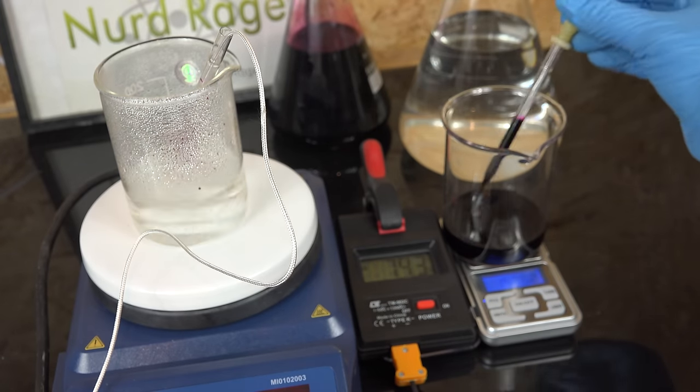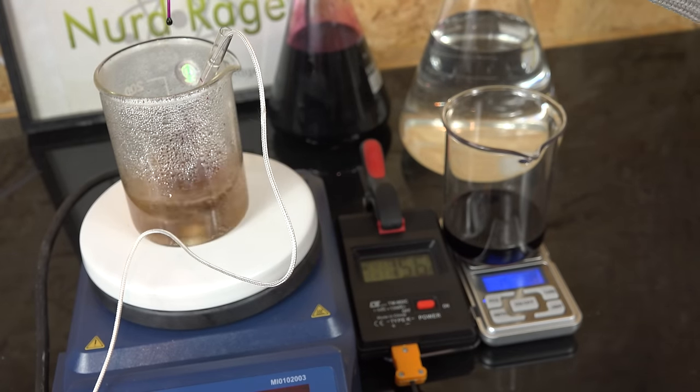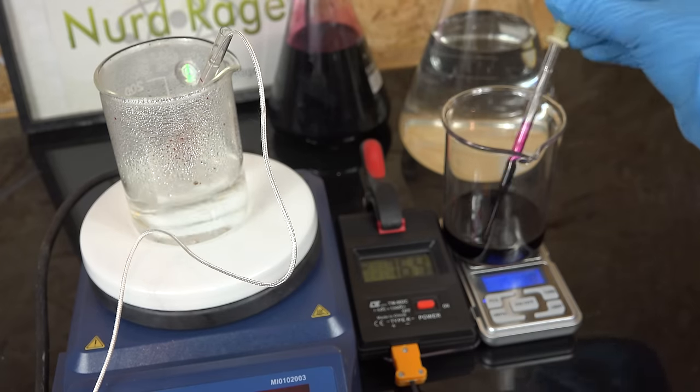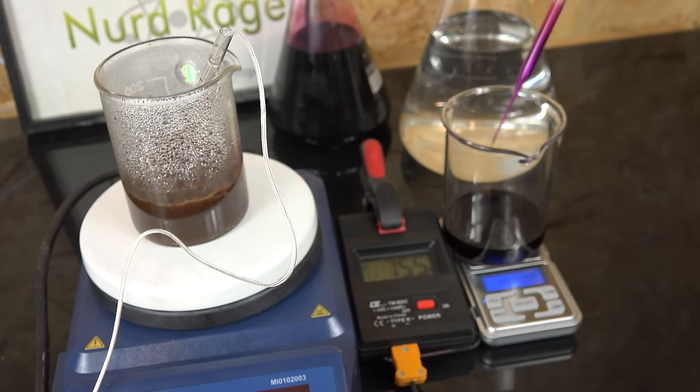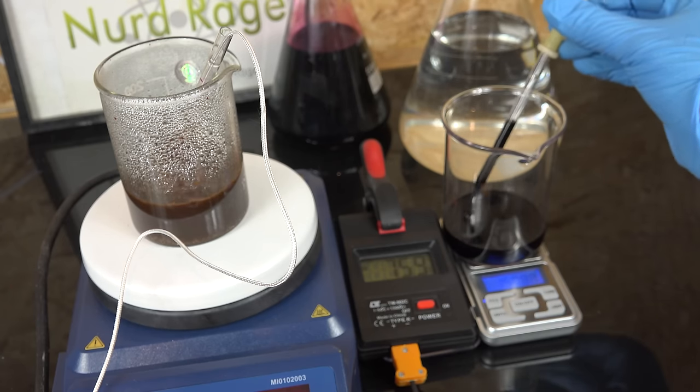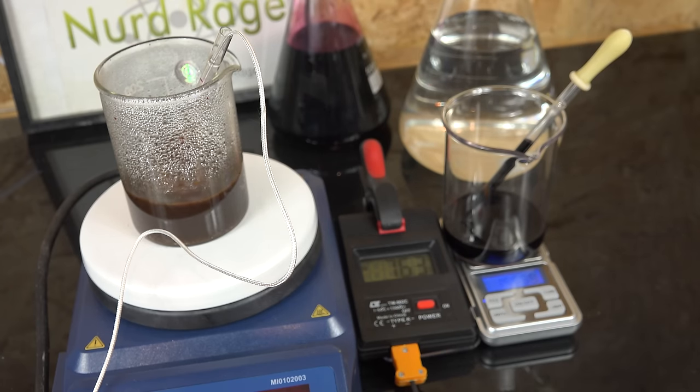When that happens it means all of the sodium oxalate has been consumed. For this first trial we're just trying to get a rough estimate of how much we need so we don't need to be too precise. And it looks like we're done. Now weigh our beaker of potassium permanganate, subtract the difference, and that gives us a rough estimate.